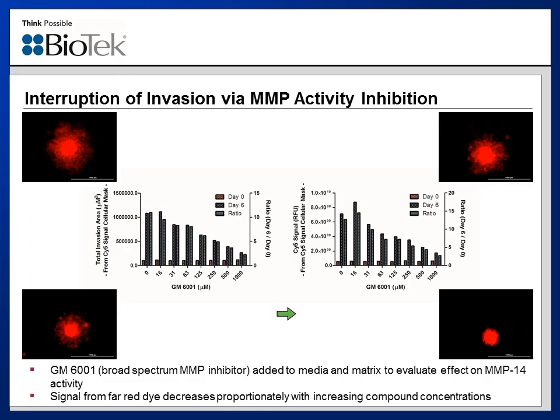And this can also be accurately detected and measured through the incorporation of the Cytation 5 and the Gen5 data analysis software.